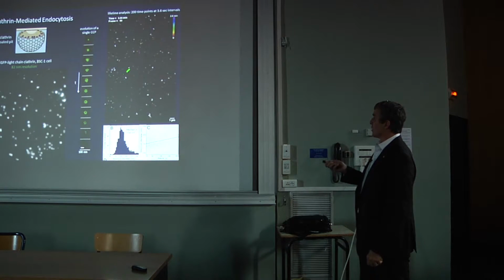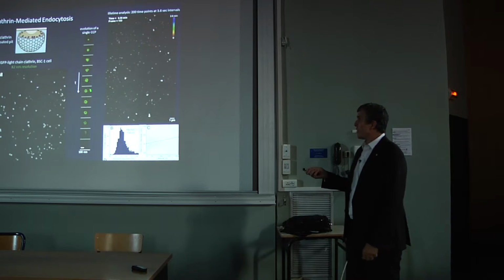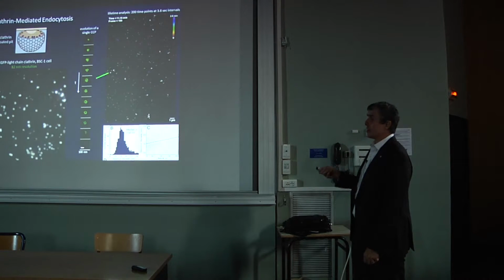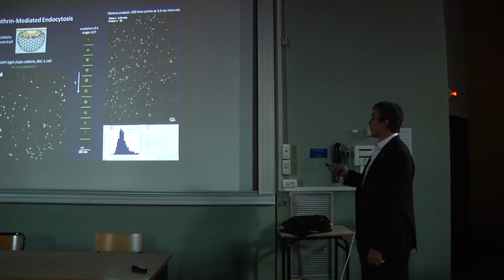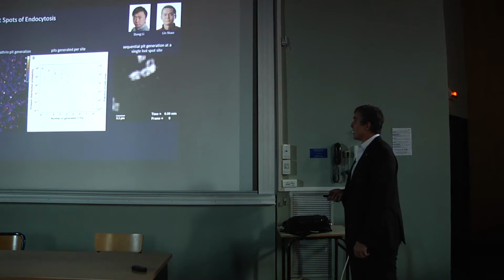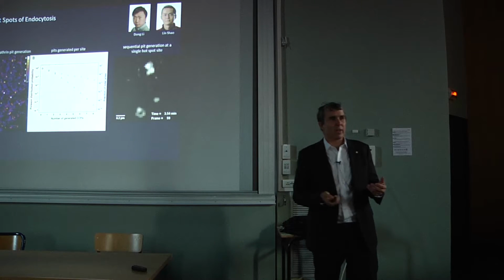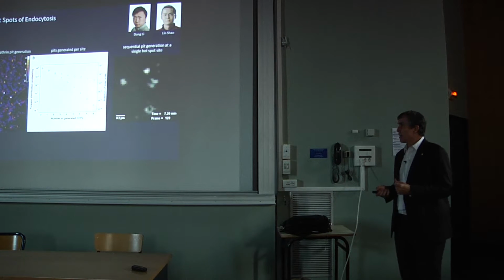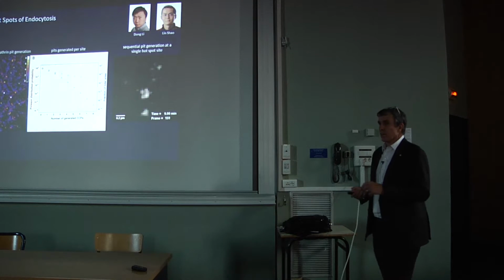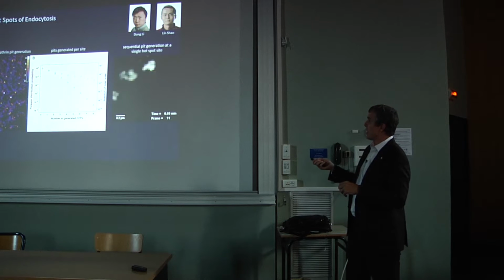And so therefore we can then track the lifetimes of these guys, as the different colors here, and then correlate the changes in size to the lifetimes to find the rates of growth and find other correlations as well. So one of the things that we learned is that these pits are formed anywhere, but actually form somewhat randomly, but in certain places there are hot spots.